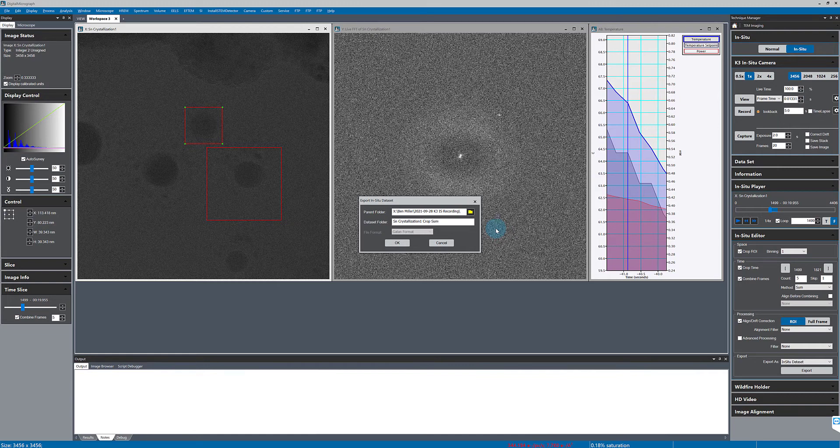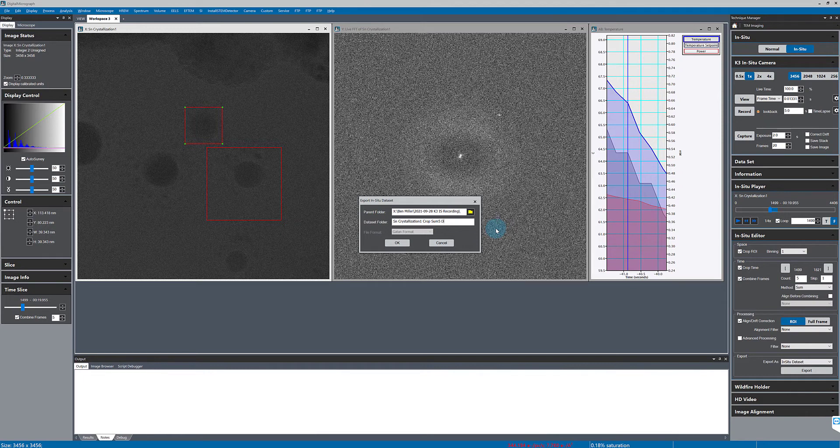Here I'm just adding a descriptive name so that I'll remember what I did to this data.